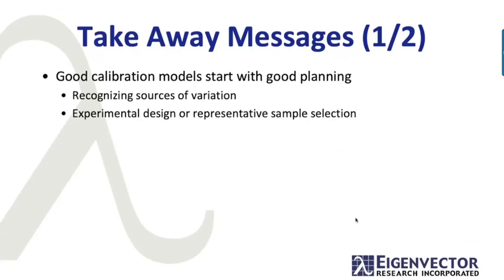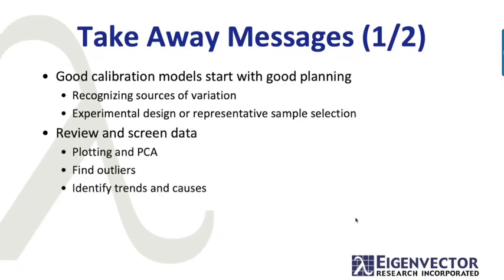And again, experimental design might not mean that you go use some experimental design software. It might mean that you use your brain and a pencil and a piece of paper to figure out what variations you need to put in. It's really not that complex most of the time, but you do have to think about it.